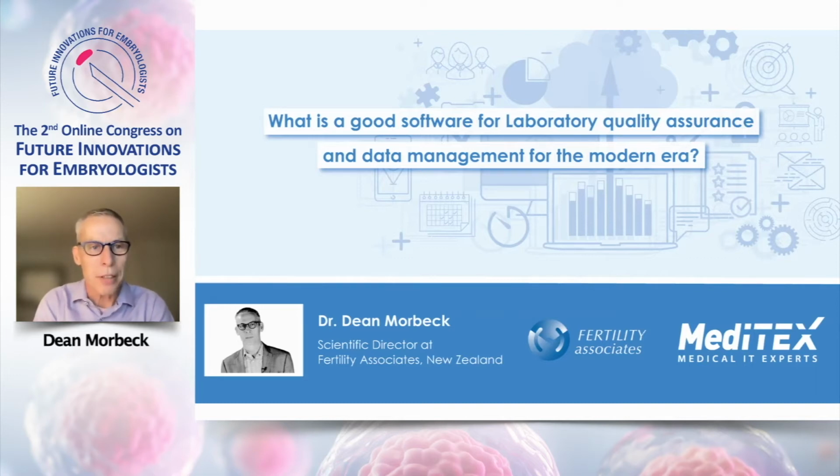And the topic here is what is good software for laboratory quality assurance and data management for the modern era. So I want to point out it's about quality assurance.